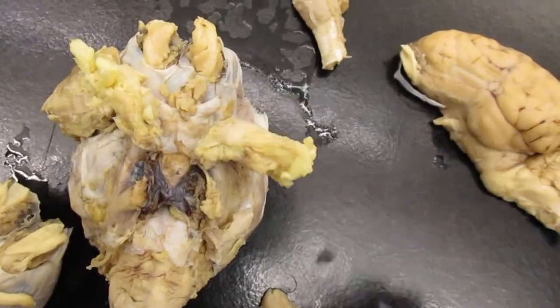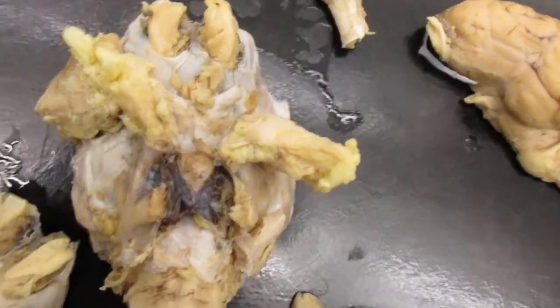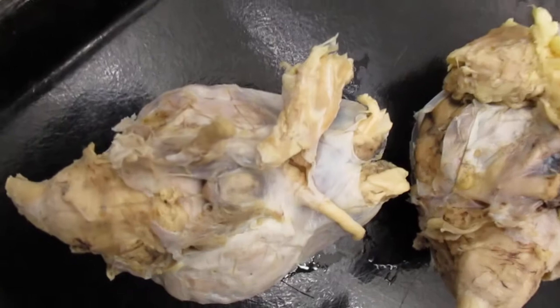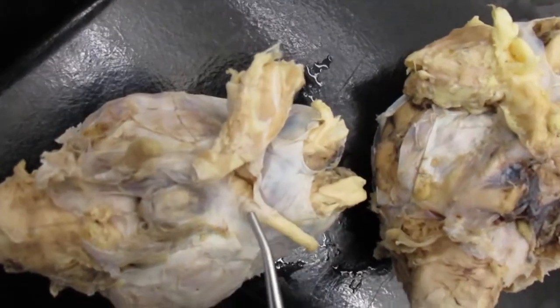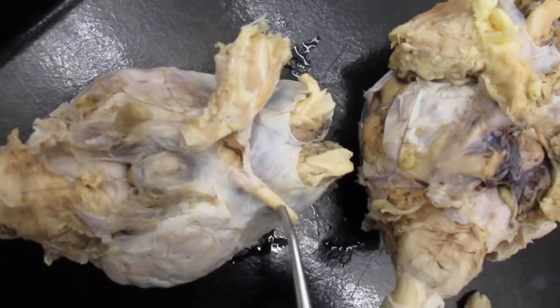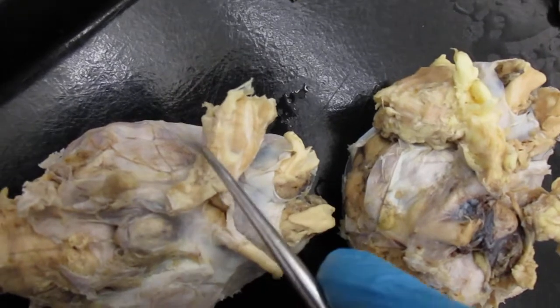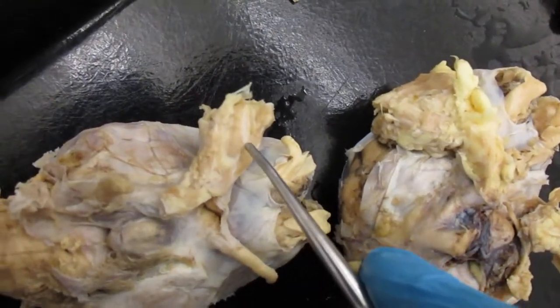And you can see there's lots of fat mixed in with your extrinsic eye muscles. Same thing here. I've removed all the fat from this optic nerve here, but right here you can still see some fat mixed in with extrinsic eye muscles here.